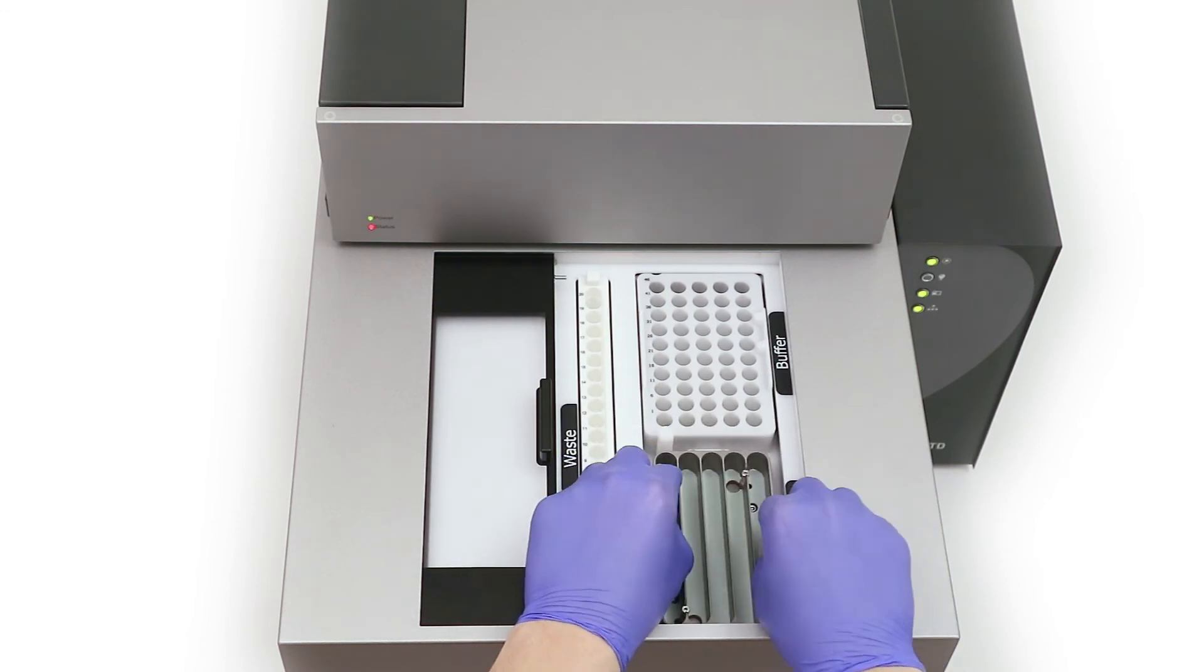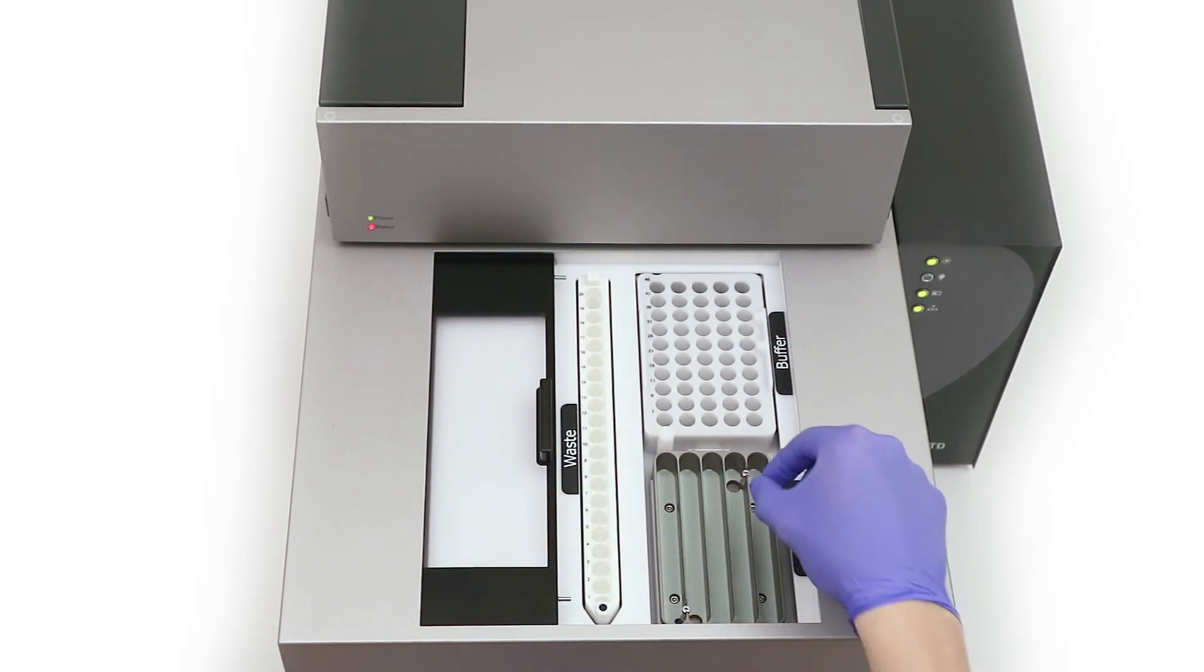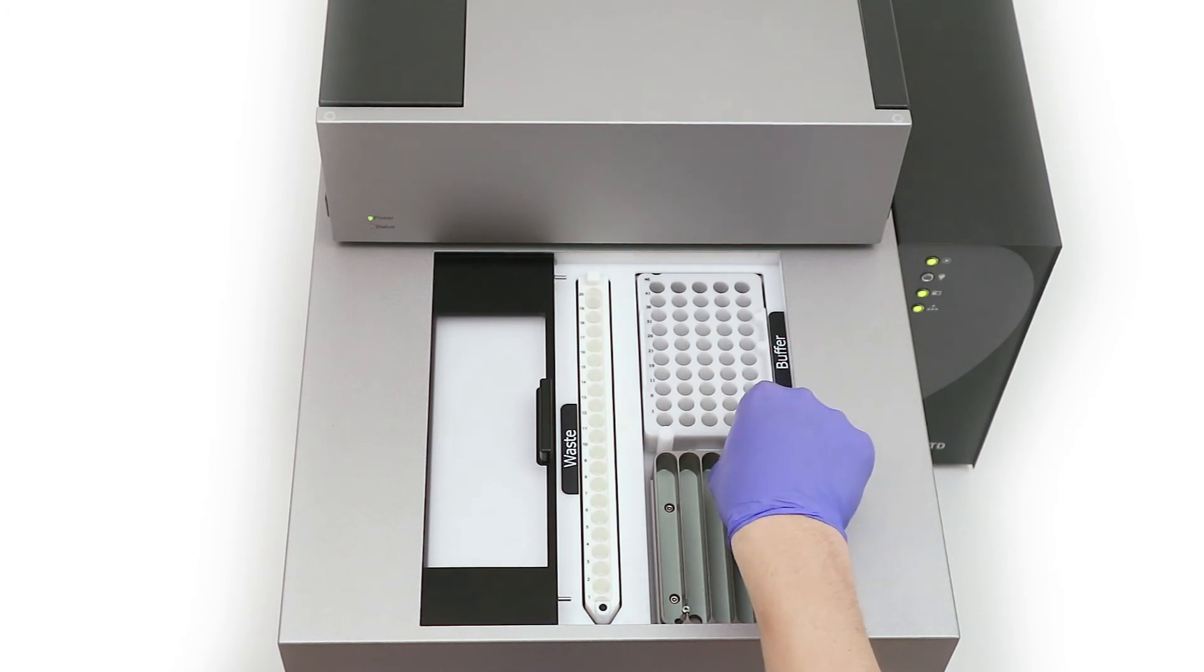Next, place the vial tray adapter into the autosampler. Push down on each of the screws and turn one quarter turn clockwise to secure the adapter in place.